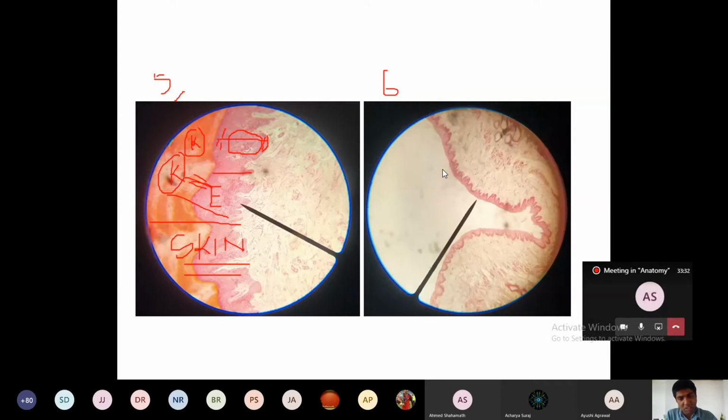There will be the follicle. Here you see follicles in the thin skin. In the thin skin, you can find thin keratin, not as thick as in the thick skin, but thin keratin will be there. I have already mentioned skin; skin means both, not only the thick, even thin also. It will be of the fifth variety. Now for esophagus you can tell, and then oral cavity, and the lower part of the anus. Okay, so this is number 6.